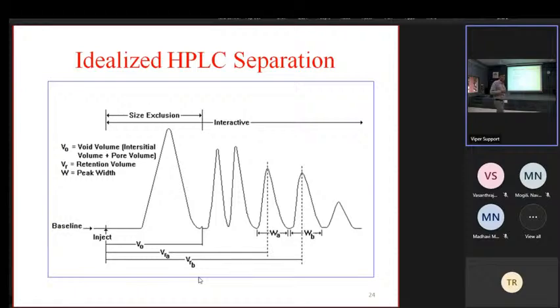Okay, so do you have any questions? A very important thing is handling the instrument, not only the HPLC but any kind of analytical or sophisticated instrument in any department. The very important thing is that you should be able to interpret the final result and spectra, and understand the results. Anyone can handle the instrument. If you train for one day, anyone is able to handle it. You just give the dose, wait for some time, 15 minutes, you'll get some result, take a print, and you will get the paper.